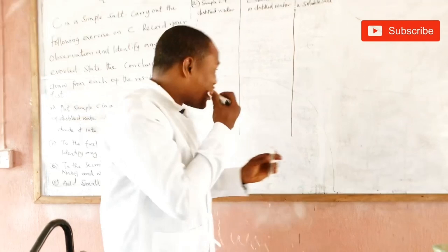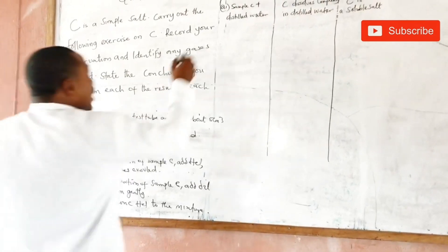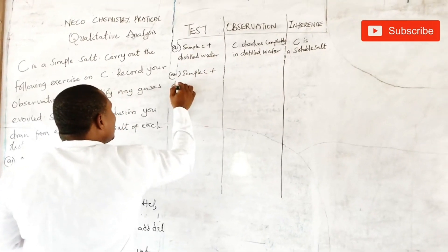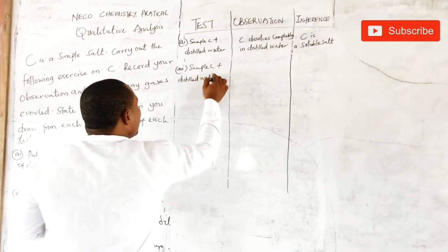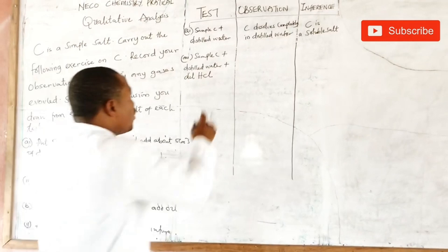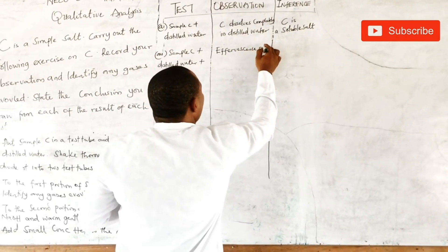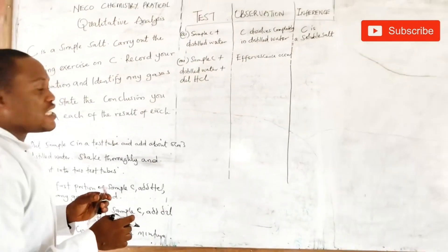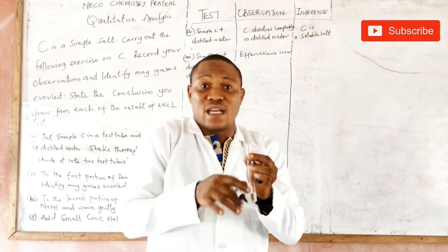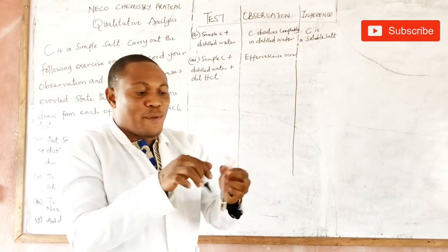You can see the bubbling of gas in liquid — that shows the evolution of gas, meaning a gas is being evolved. I'm testing it with my blue litmus paper. So what can I infer? Roman figure (a)(ii): Sample C + distilled water + dilute HCl. Observation number one: I notice what we call effervescence. Effervescence is the bubbling of gas in liquid, representing the evolution of gas. I test the gas with my blue litmus paper.